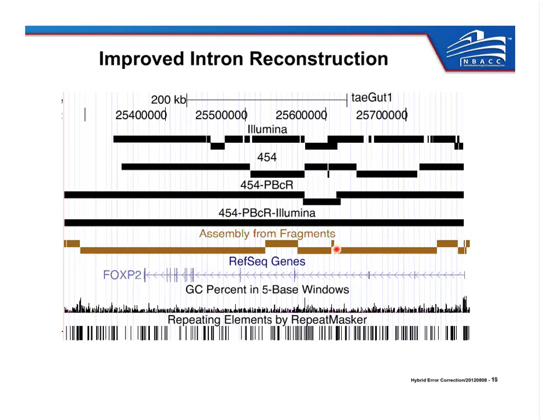So you can see that the Sanger assembly is relatively decent. There are not too many pieces here, but it can't reconstruct the full intronic sequence of this gene in one piece. It has breaks in some regions. Some of those breaks, for example, the break here corresponds to a higher GC window. So this track down here shows GC content along this gene, and there are higher GC windows in intronic sequence and maybe promoters, regulatory sequence, than in the exonic sequence. And you can see that the Sanger data has some trouble assembling in a particular high GC window here, as well as at the end here where it gets more fragmented as the GC bias increases.